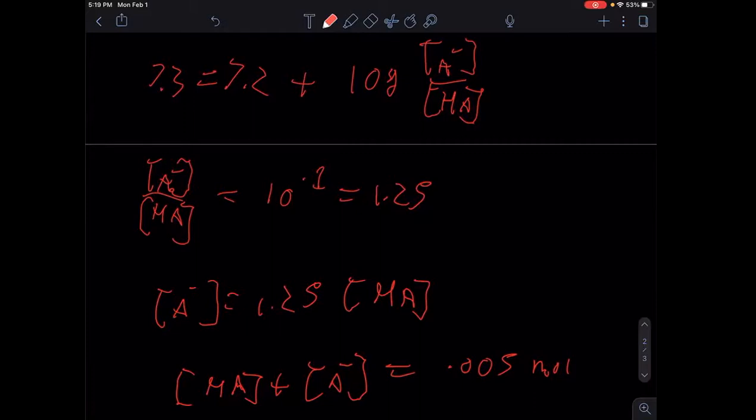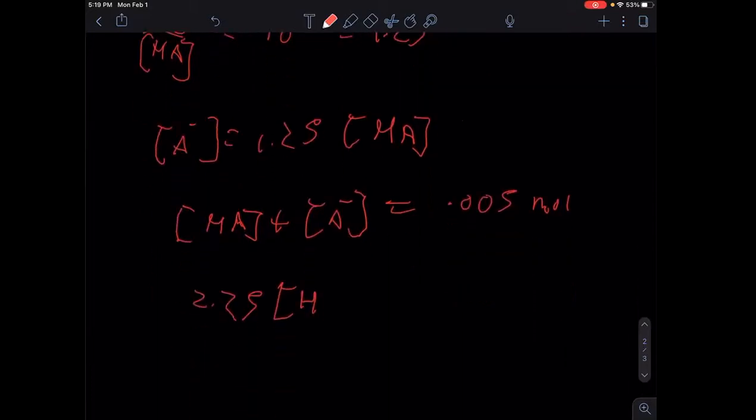The reason is, like I said, the step of making the buffer is we measure the powder, we add the strong base or acid, then we add water, but we are not adding 50 ml of the water. We just add water to bring the volume to 50. So actually we are not changing the volume by adding this. Okay, I get that. That makes more sense. Thank you.